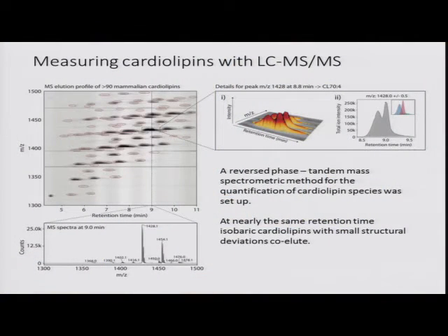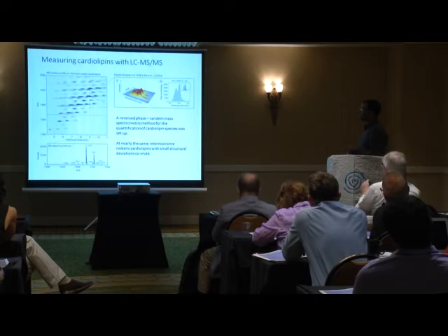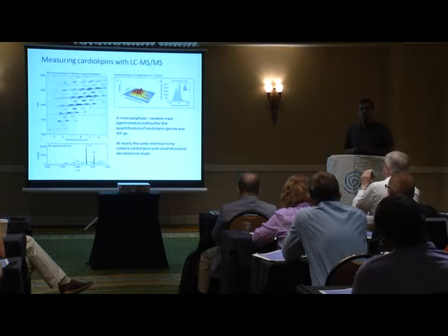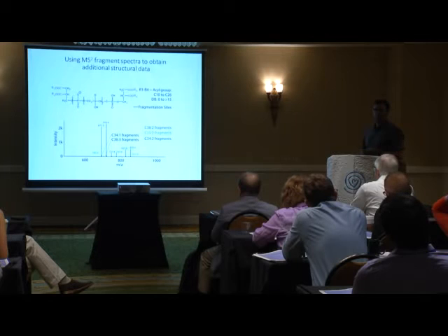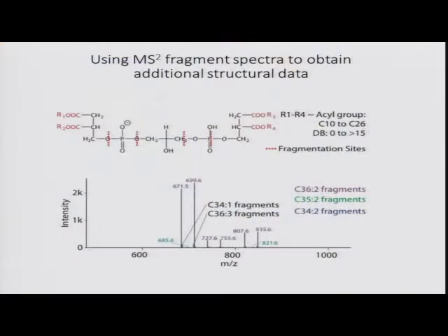And in order to get more structural information about all these individual cardiolipin species that are eluting throughout the gradient, one can perform fragmentation analysis, or MS2 spectra, by picking one of these peaks, bombarding it with nitrogen atoms in this case, and then measuring which kind of fragments are established during this process. And for cardiolipins, this is really well defined, which kind of fragmentations you get by bombarding.